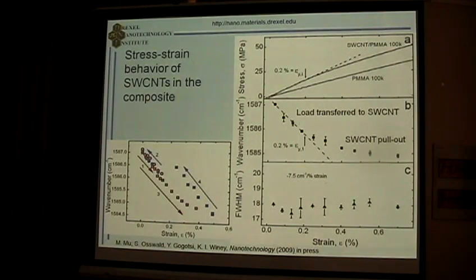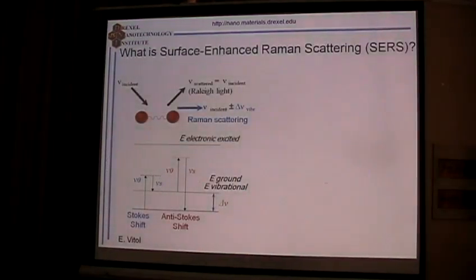So it gives us opportunity to get insight into behavior of nanotubes in the composite that would be impossible to gain by other methods. And we can do it, of course, with a very high resolution, with, say, 1 micron or better spatial resolution, so we can see also, for example, changes in stresses within the volume of material. So there is this type of a very interesting, important thing for carbon nanotubes research that can be done using this method here.